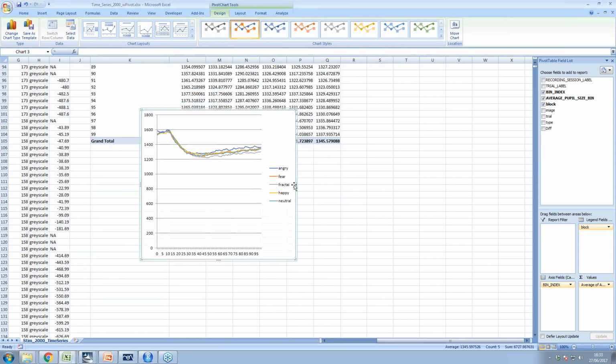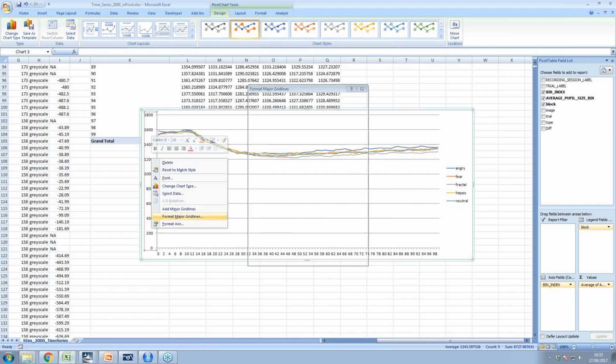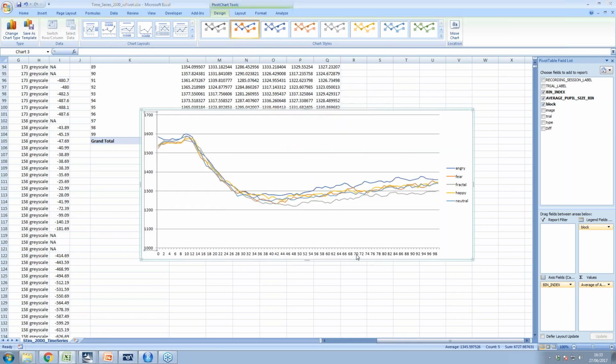Again, it's not done something sensible with the scale, but you can fix that relatively easily by giving it a fixed minimum. And there, yeah, there you can see. So by not having an isoluminant stimulus, we've basically made our interpretation somewhat difficult, because rather than, as expected, seeing a bigger dilation for angry or fearful faces compared to fractals, what we've seen is a lesser constriction.